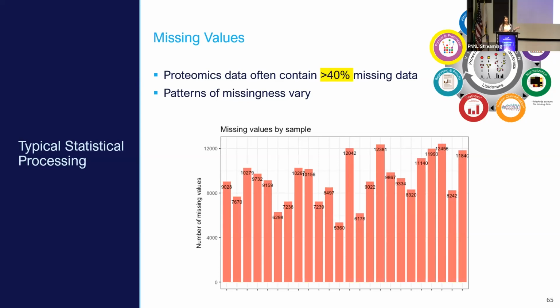This isn't anything alarming. Sometimes you might have one sample with a really high spike relative to every other sample, and that is something to look into. Maybe something happened in sample processing, for instance.